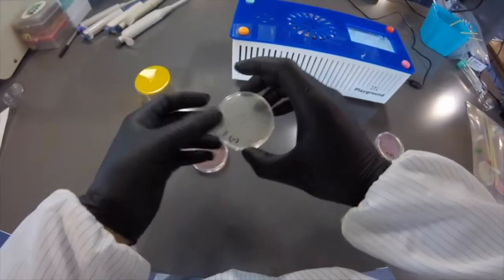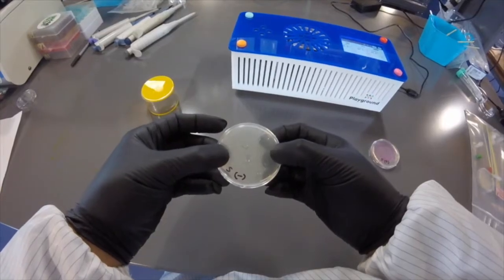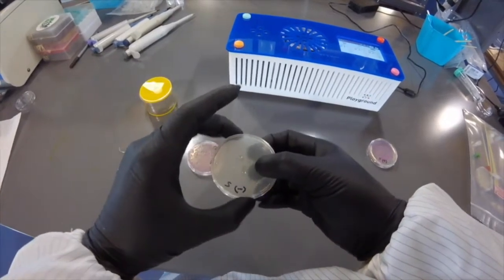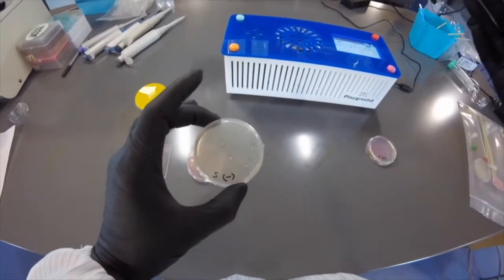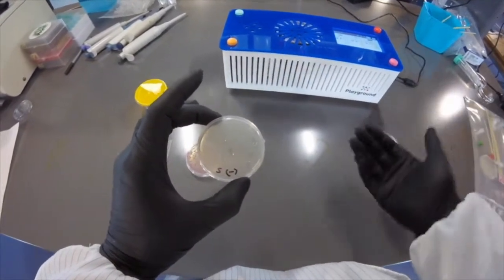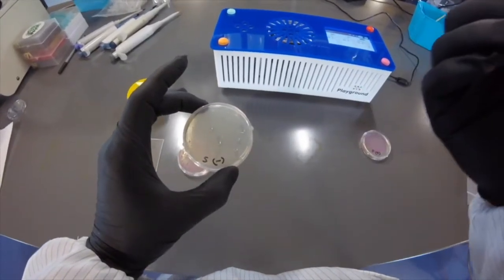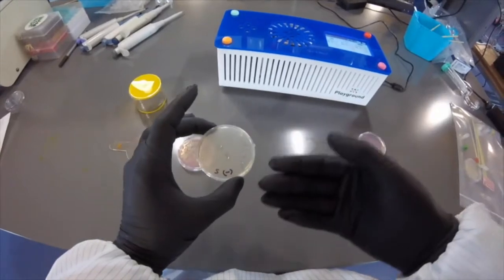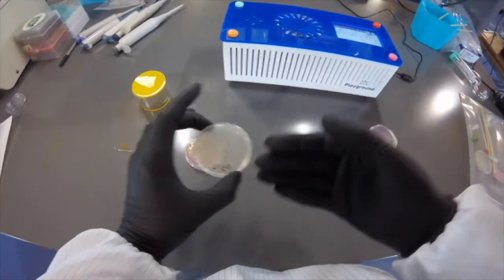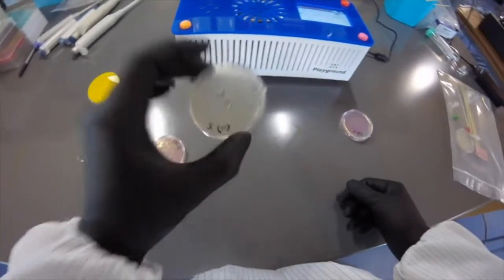Let's look at the negative control. The negative control plate doesn't show any bacteria, and this is expected. When we streaked the blank cells, they don't have the plasmid for antibiotic resistance, and that's why we don't see them grow. If we had seen them grow, that would suggest the plates didn't have enough antibiotics and could have helped us troubleshoot.